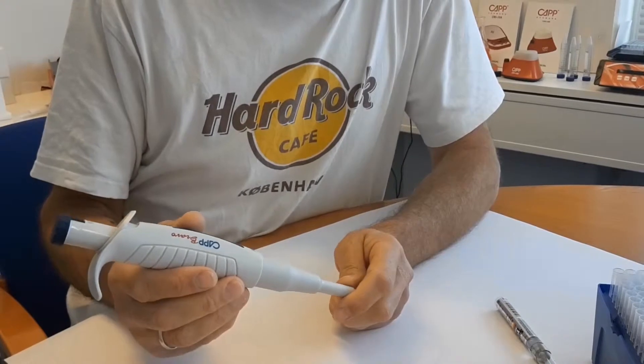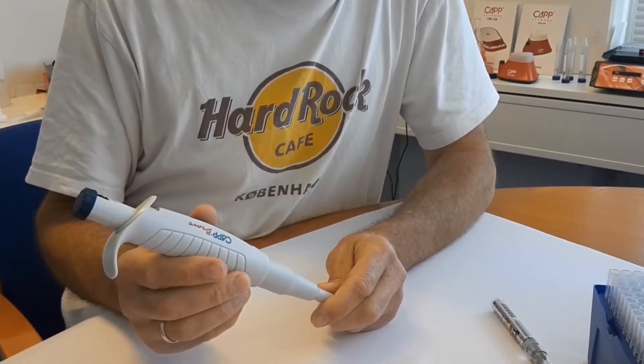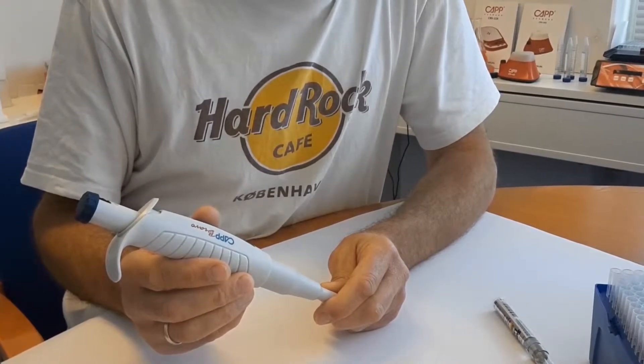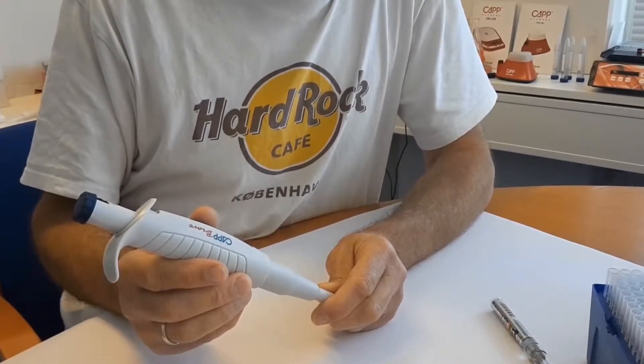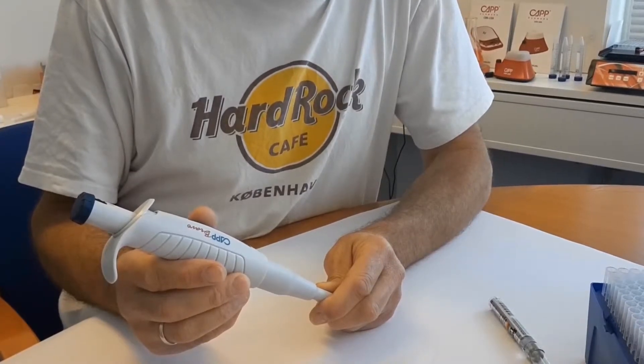If the pipette is leaking or not aspirating any liquid, you must be sure that the problem is on the pipette and not on the tip in use. Test it with CapExpel Plus low retention tips. Contact info at cap.dk for free samples worldwide.